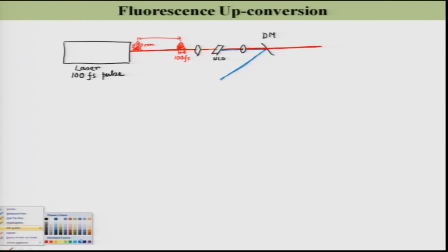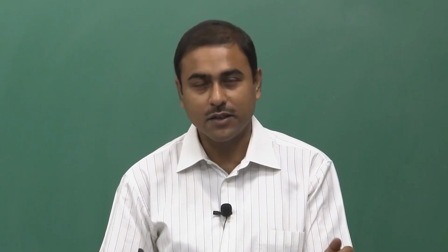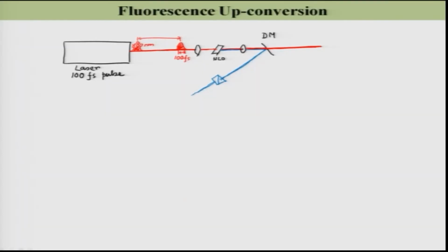Then we will put a device over here, which I am going to discuss later. This device is the same device which I skipped during the discussion of the TCSPC system. I said the polarizer, again here is a similar kind of thing. What is the necessity of this, I am going to discuss later. Then you can put another mirror over here, and this light can be used, through some lens, to excite your sample. Here you have the lens and here you have your sample.